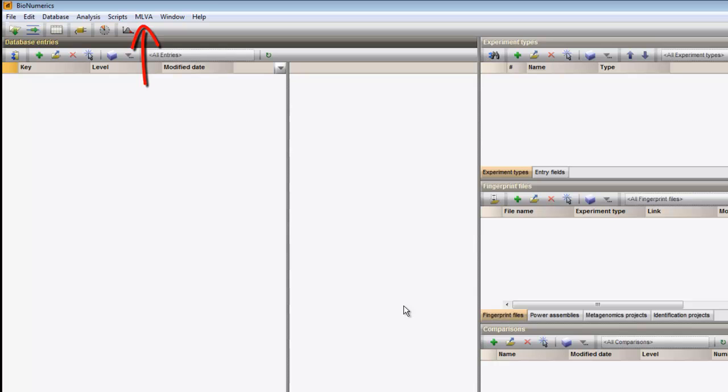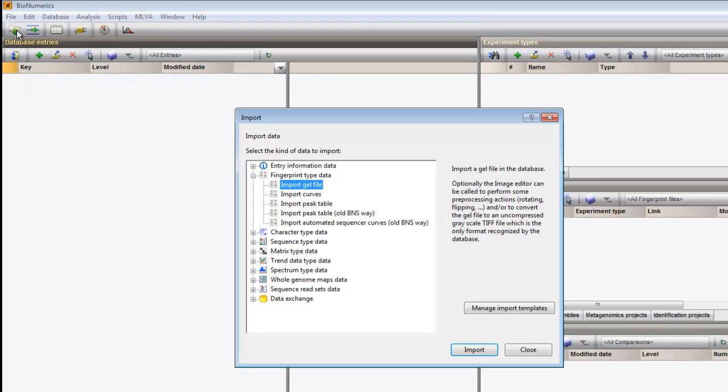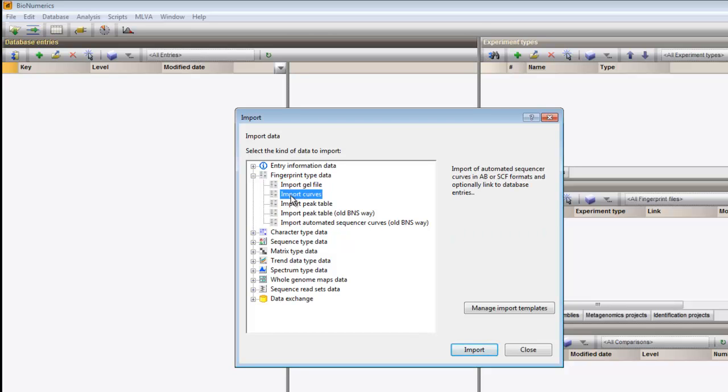A new menu item is added to the main window. Next, we will import VNTR sequencer curve files in this database. Press the import button and, under fingerprint type data, choose Import curves.